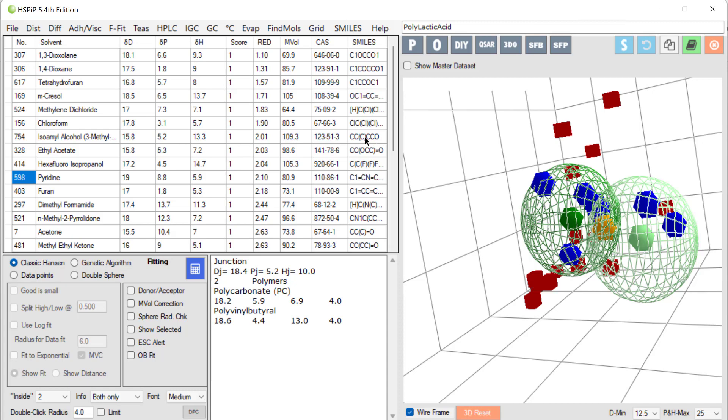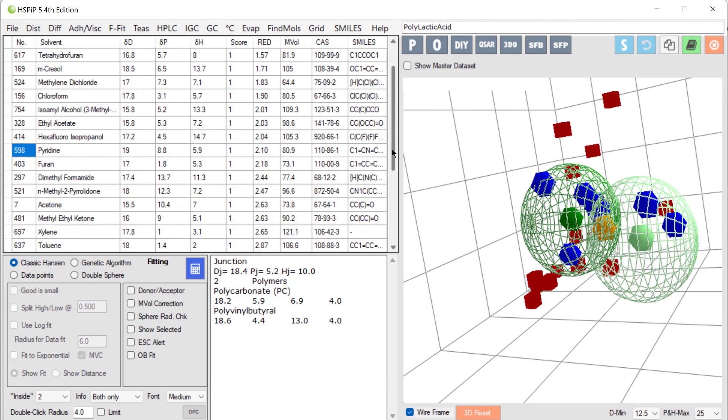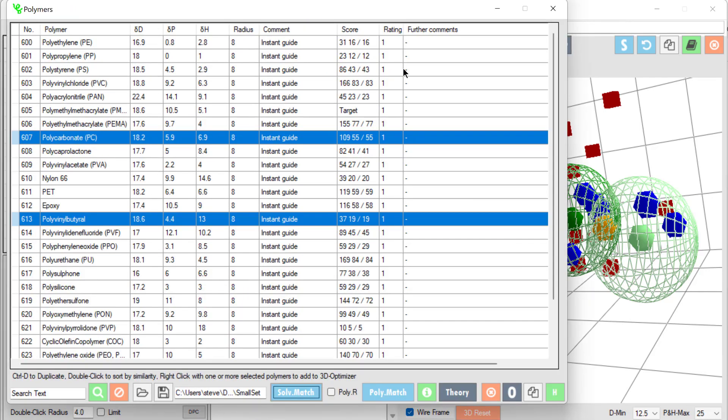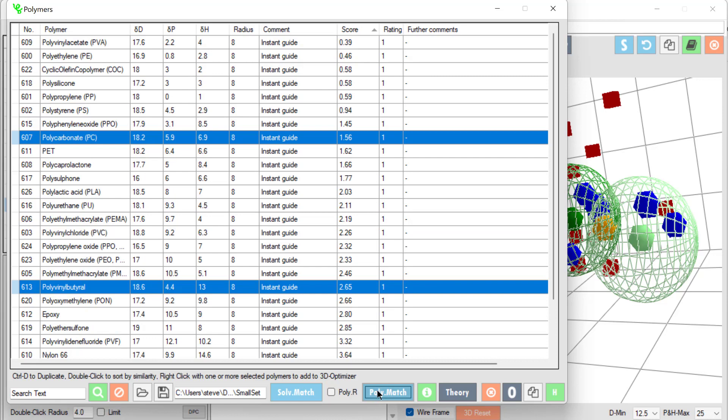We can do some other things with these solvents. We can, for example, select xylene and then go to the polymers form again and do a polymer match. So that's now matching the polymers to our solvent xylene.